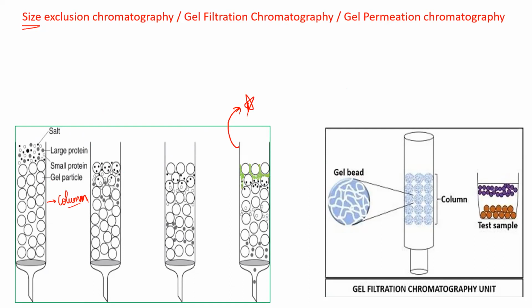Yes, these are the gaps. The columns are definitely going to have gaps. Gaps is a common word, but in column chromatography, they are called voids.